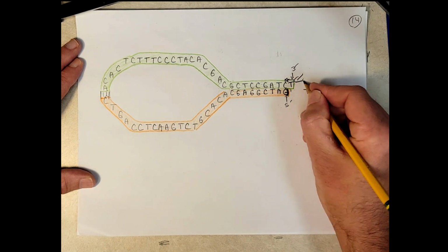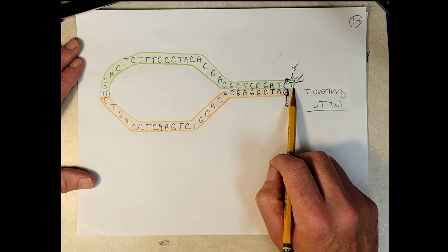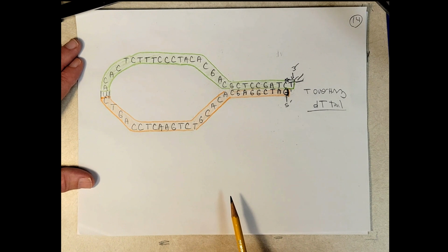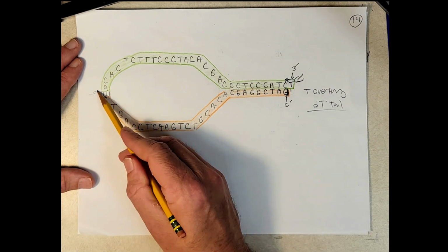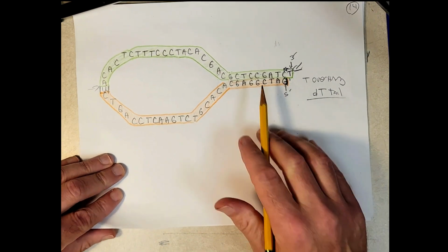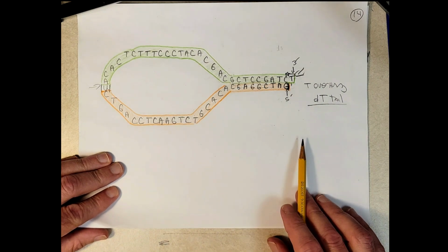And look at this, we have a T-tail at the 3' end. Our molecules in the library, the molecules that we want to sequence, all have A tails. Well, this has a T-tail at the 3' end. And this is where the phosphorothioate bond is. Here's our uracil over here. So that's the actual sequence of the NEBNext adapter, and it adopts this structure when it's in solution.